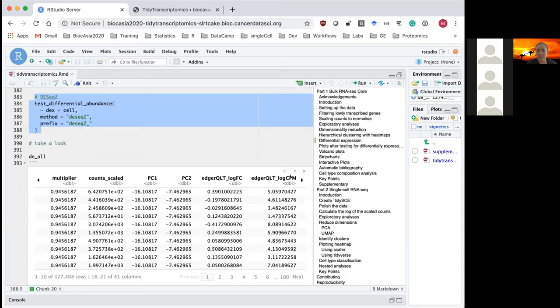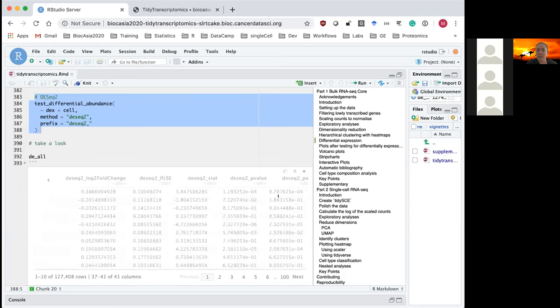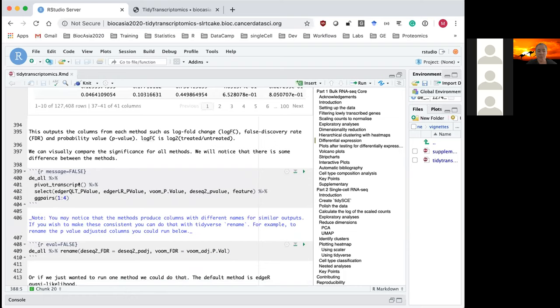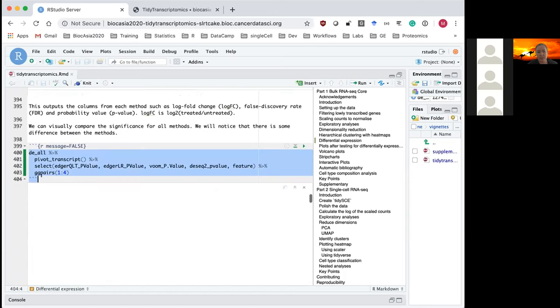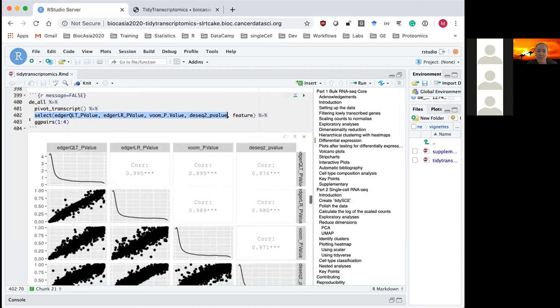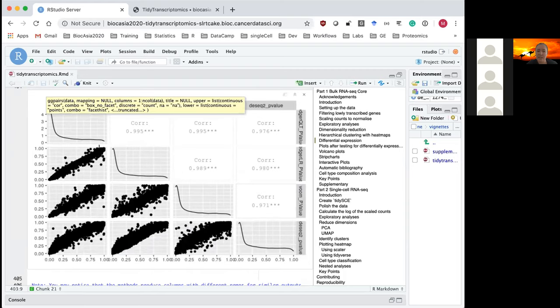The output table has columns from each method — log fold change, p-value, and adjusted p-value columns from edgeR, limma-voom, and DESeq2. To compare how methods perform, tidybulk provides pivot_transcript — equivalent to pivot_sample — which gives transcript-specific information. We can select the p-value columns from all four methods and use the ggally package to do pairwise comparisons, showing that the two edgeR methods are more similar to each other, while limma-voom and DESeq2 are more different.